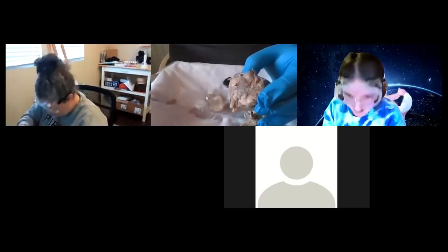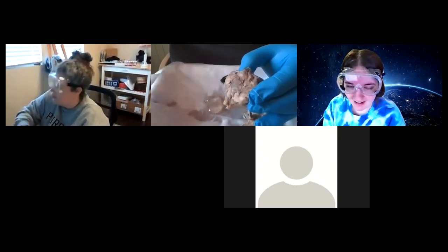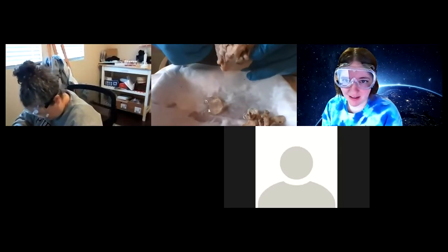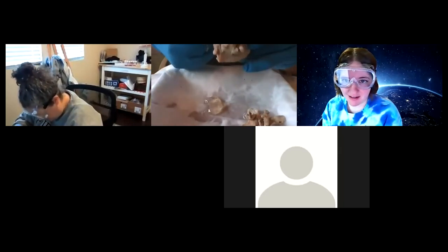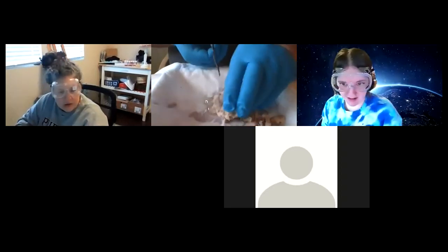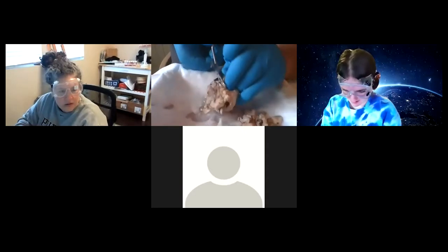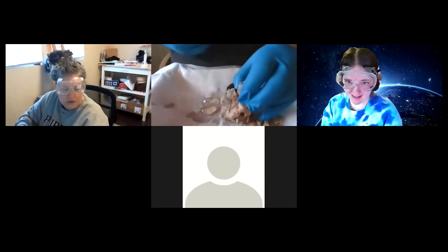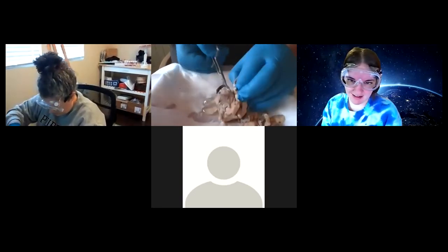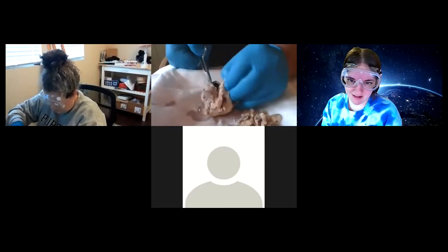I'm going to cut this, and this is not easy. My hands are all slimy now from the vitreous humor. This is really hard to cut. I may even use a scalpel. Don't cut your gloves. This part is going to take time — don't try to do it too quickly.